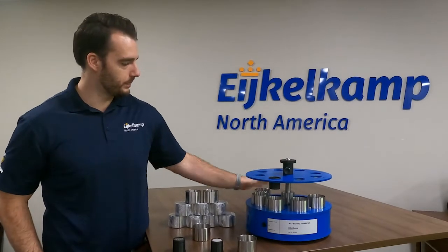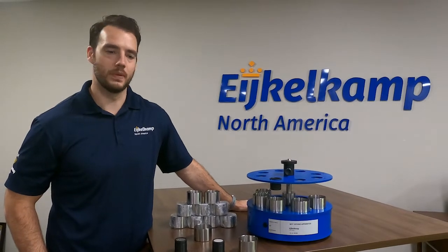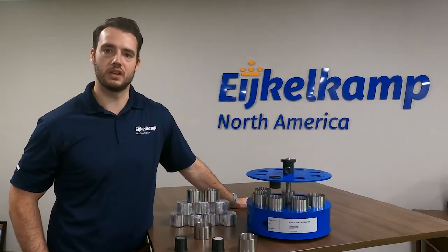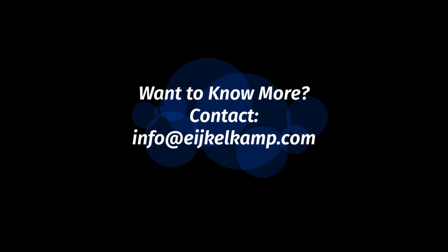This is a great little setup — we see a lot of these going into lab spaces and they really just last a very long time. Please reach out if you have any questions. There's a great manual and a lot of instruction videos on how to use these, with links at the top of this screen.